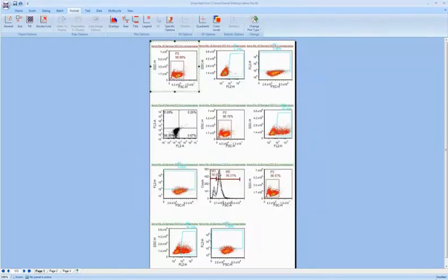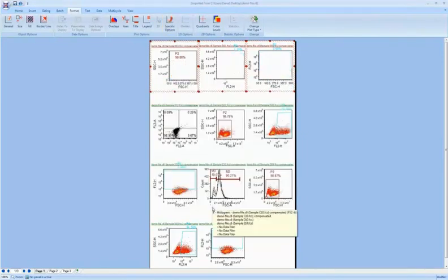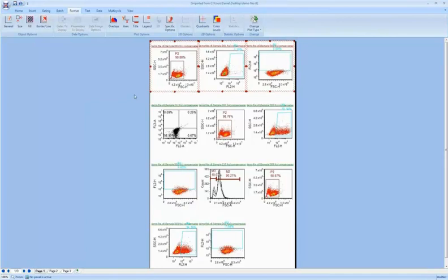And if I want to do them on these three plots at the same time, I simply go to the specific options, and now I type in that I want to go from 50 to 500. And the data disappeared, but it's doing exactly what I asked it to do, so I will undo that. And you can also do that in the general preferences instead of having to do that on a plot-by-plot basis.